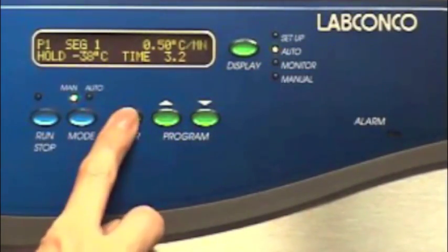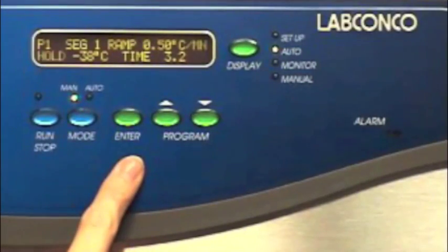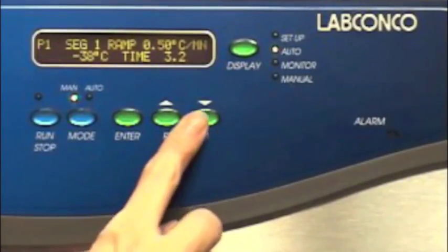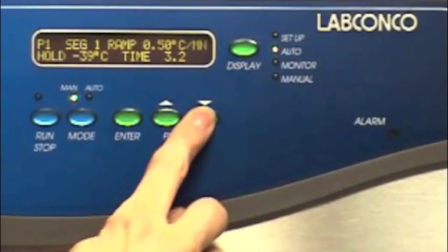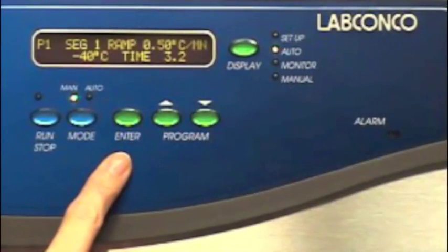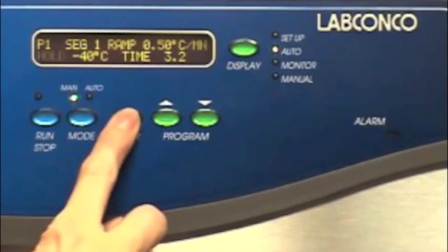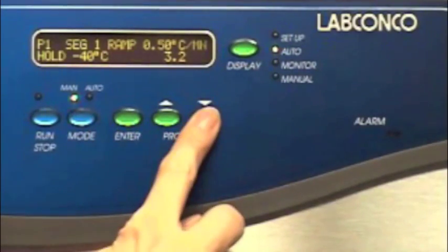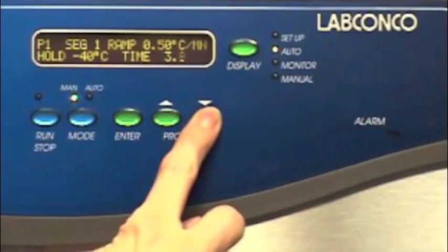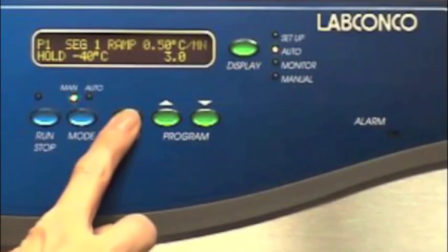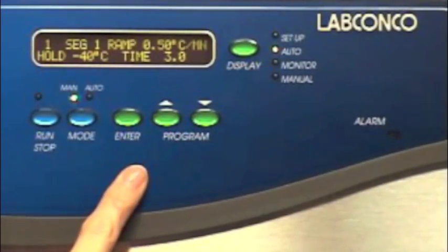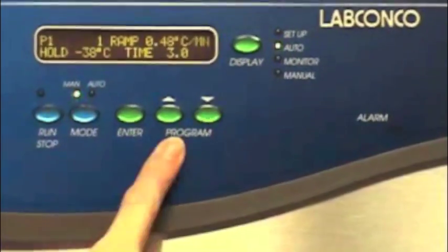Press enter to advance to hold and select minus 40 degrees centigrade. Press enter to advance to time and select three hours. Press enter again. We've now programmed segment one.